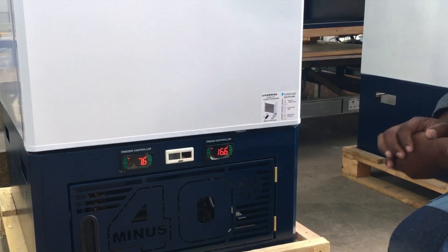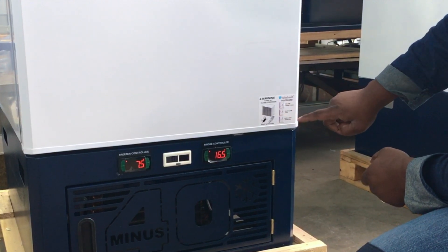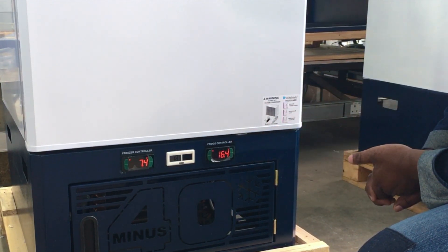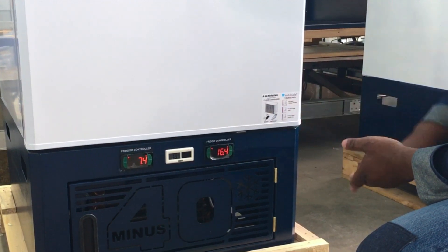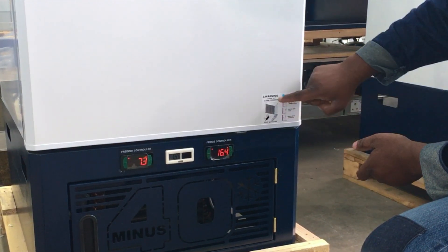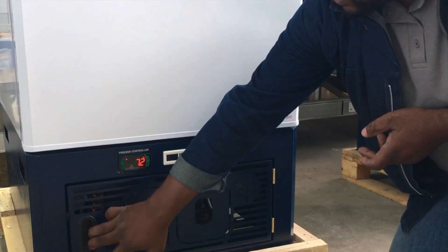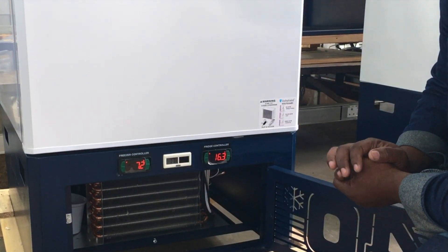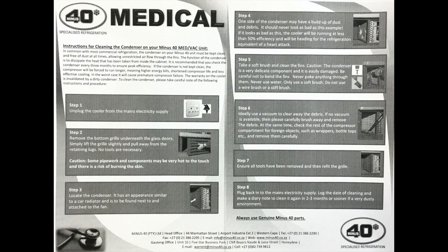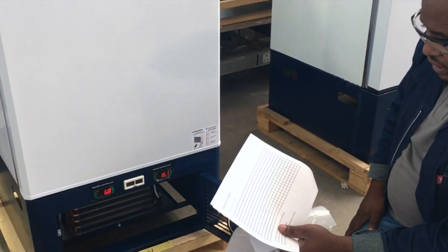Make sure the voltage protector shows a green light before using the fridge. This fridge has a new controller with a warning alarm to clean the condenser. When you see 'AC1' appearing on the fridge controller, explain to users during training that they need to open the service panel and clean the condenser. Instructions on how to clean the condenser are in the manual. They should clean the condenser monthly and keep records.